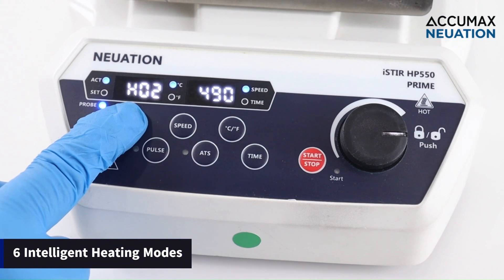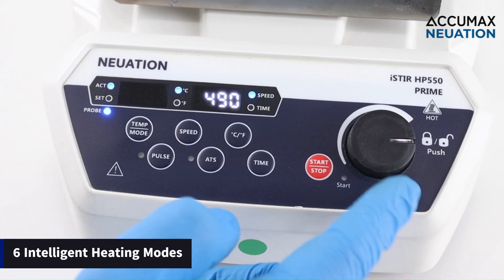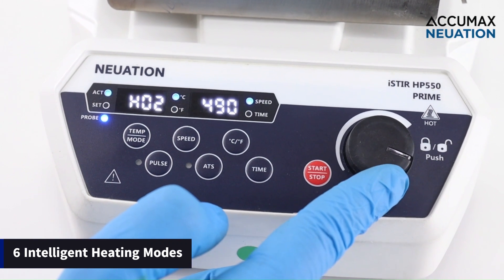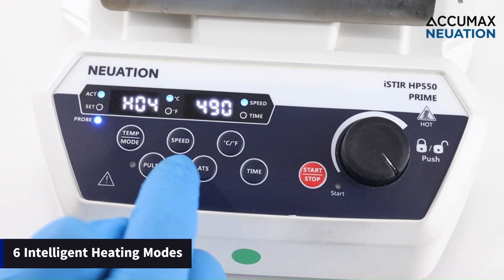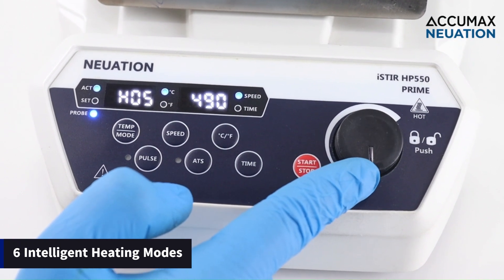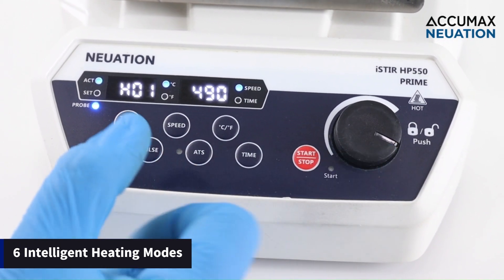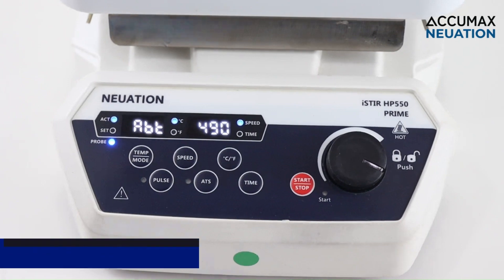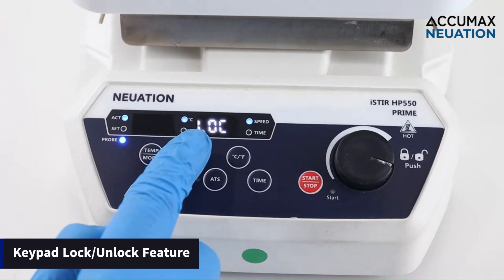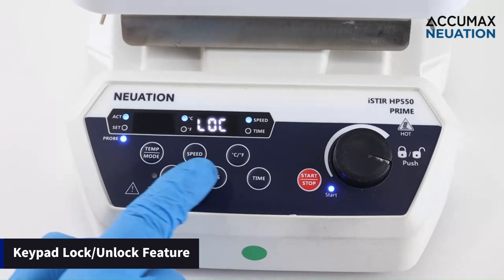It is equipped with 6 inbuilt heating modes — slow heating, fast heating, and rapid heating — with high accuracy for volumes ranging from 300ml up to 5L. The HP 550 Prime also features a keypad lock, which is a safety feature to prevent any accidents.